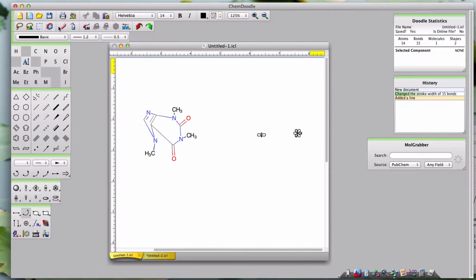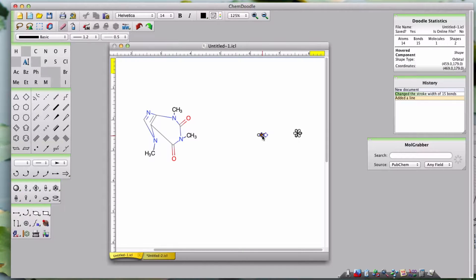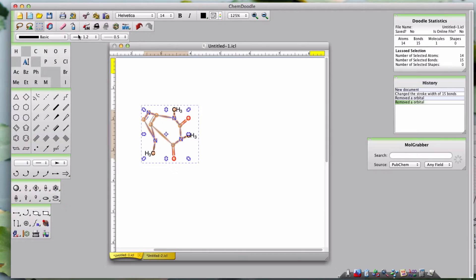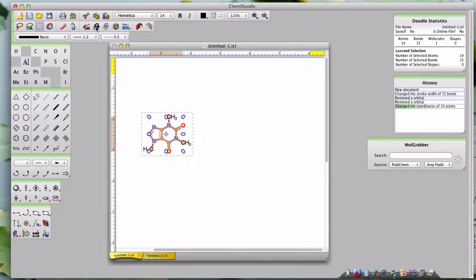I've already shown some of the content toolbar. The rest of the toolbar allows you to manipulate content. For instance, I can erase content or revert a structure to an optimized 2D shape.